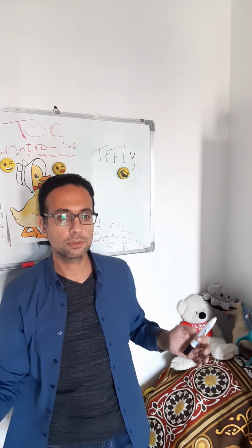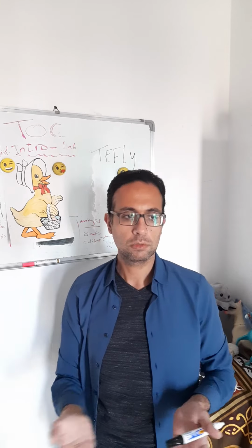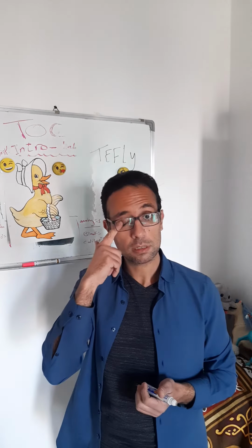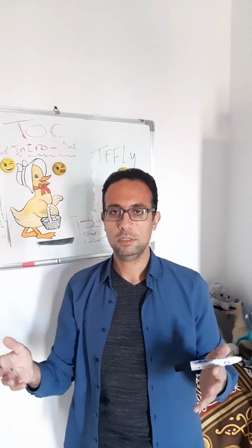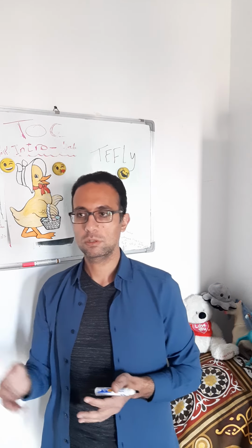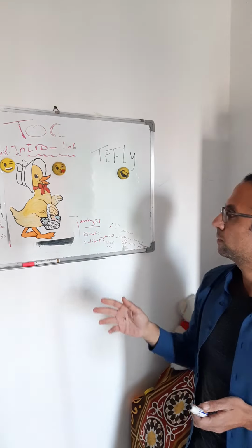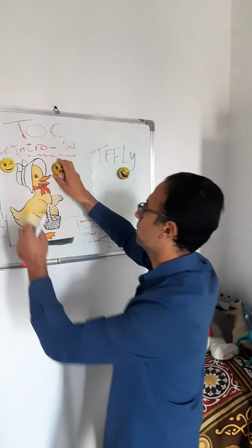In the lab we analyze many parameters, starting from simple analysis like pH, conductivity, TDS, salts dissolved in water or any liquid samples, like in pharmaceuticals, also water for analysis. So we will talk about TOC, where we can find TOC.